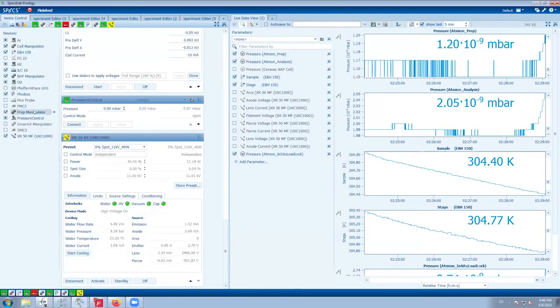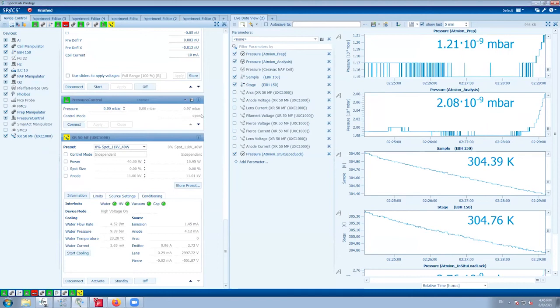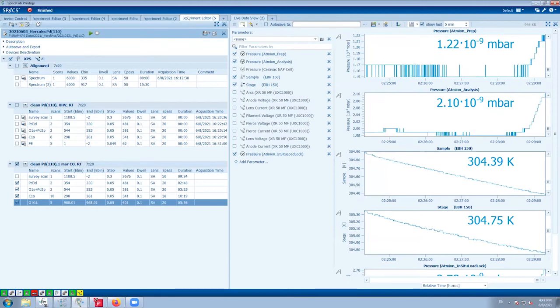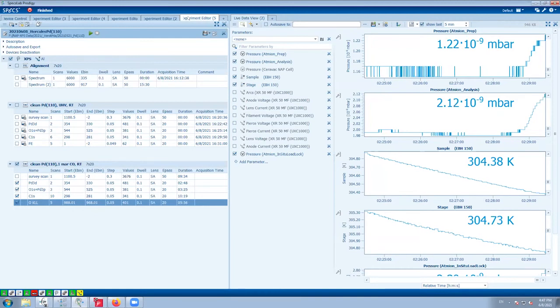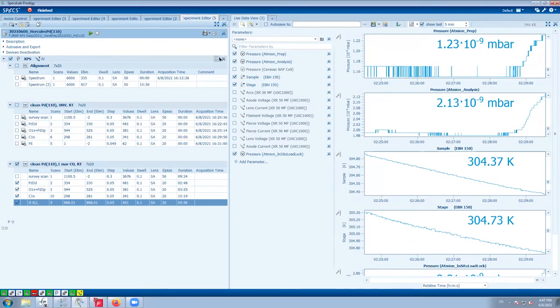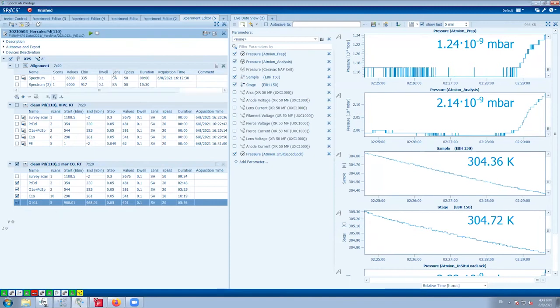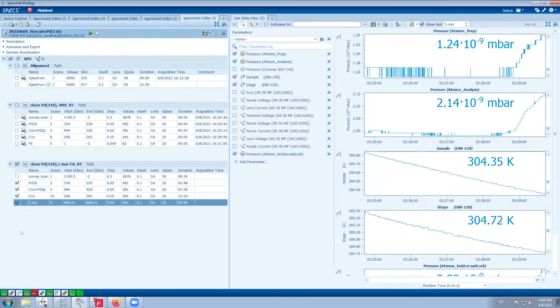So soon we'll be on the values. It's going to 40 watts. We'll be able to start the measurement. It is expected that the signal maybe will be a bit lower than in vacuum because, as I told you, with gas attenuation, usually at 1 millibar you lose maybe like 20–25% of signal, depending on the type of gas. With higher pressure, it goes quite exponentially. At 4 millibars, 5 millibars, you already have only maybe 10% of the original signal.